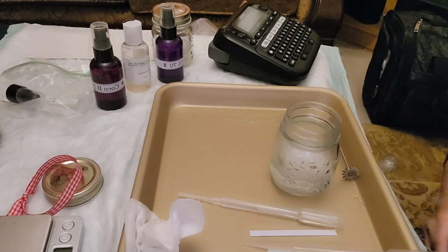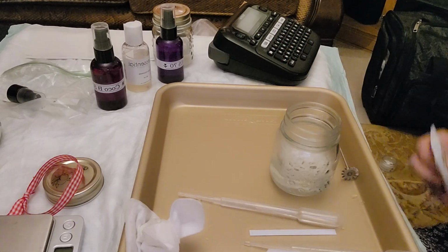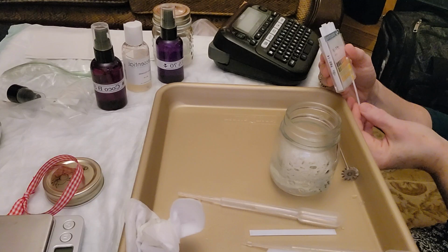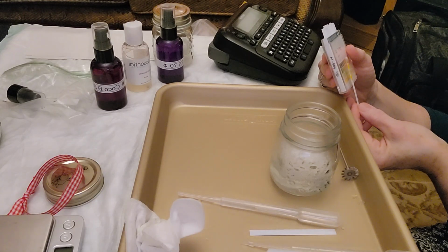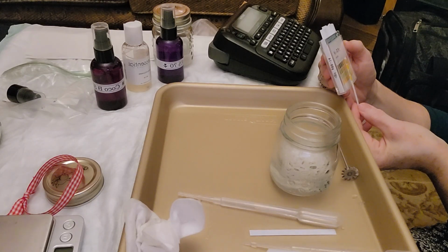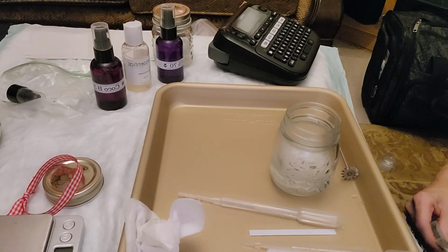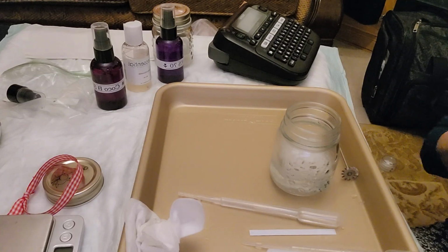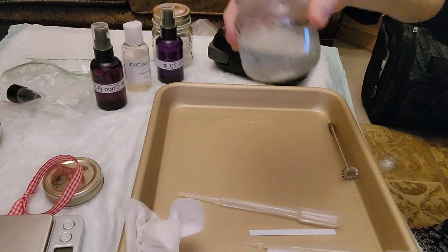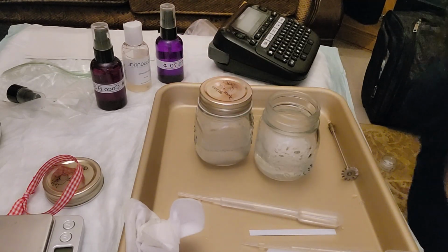Let's see what our pH is now. I really have to set up my pH meter because, let me tell you, oh, it's changed quite a bit. So we're getting into between 4 and 5. Yeah. So I can't go down any further. And it didn't really affect viscosity there. That was really cool to see the difference in clarity just from that change in pH.